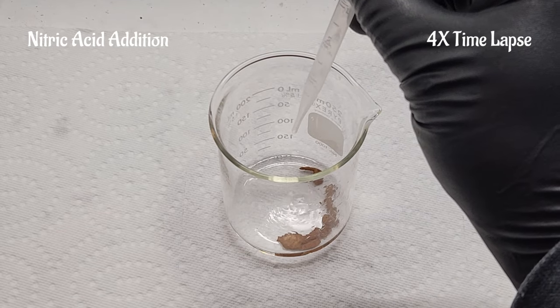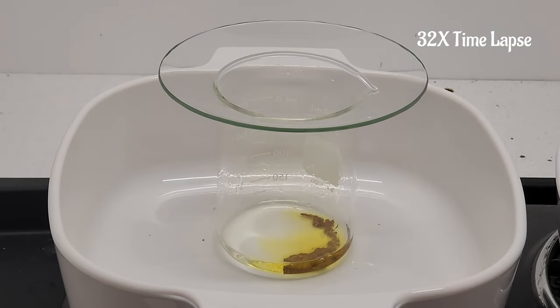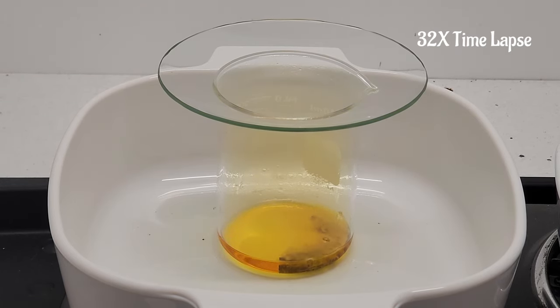We start by dissolving our gold using a 4-to-1 mixture of hydrochloric and nitric acids, known as aqua regia, at a rate of 4.2 milliliters per gram of gold on low heat. A few drops of sulfuric acid are added to precipitate any lead that may be present.